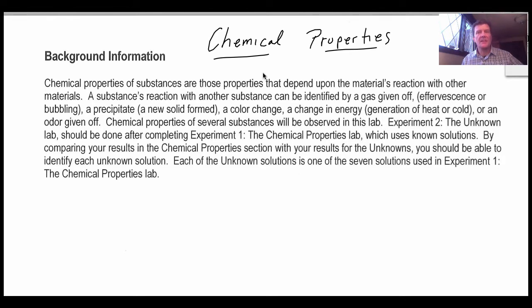And then we're going to look at different reactions, and from the outcomes of those reactions, you're going to be given a couple unknown solutions, and you're going to have to try to determine what they are by how they react with some other chemicals. Okay? First of all, let's just go over a little background information.